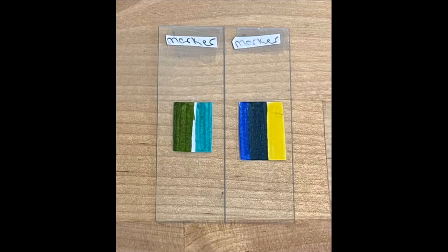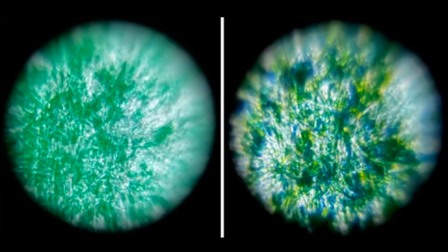When using a washable marker to do the same demonstration, the green color gets more intense on the paper as more fibers are coated with the pigment. But the Foldscope images still allow you to see spots of yellow and blue pigment as compared to the pure green washable marker. It is interesting to note that even when using a washable marker, uncolored paper fibers are still visible under the Foldscope.